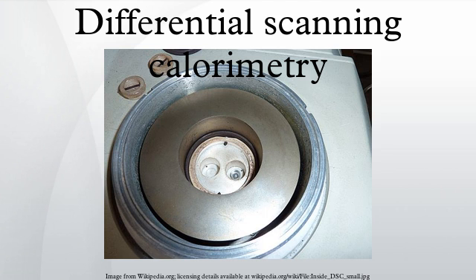Glass transitions may occur as the temperature of an amorphous solid is increased. These transitions appear as a step in the baseline of the recorded DSC signal. This is due to the sample undergoing a change in heat capacity. No formal phase change occurs. As the temperature increases, an amorphous solid will become less viscous.